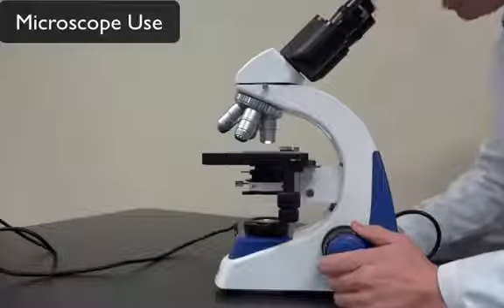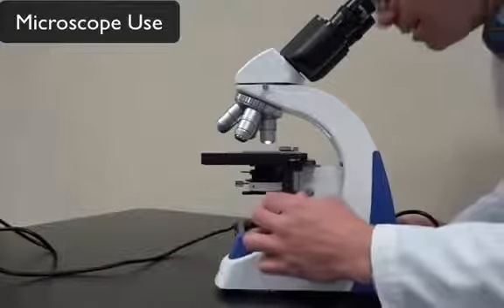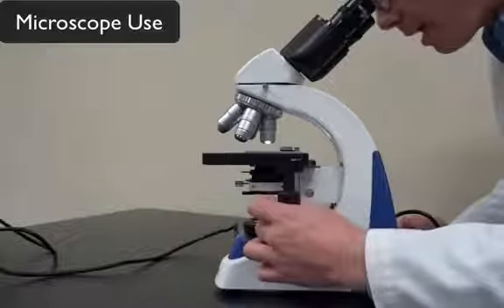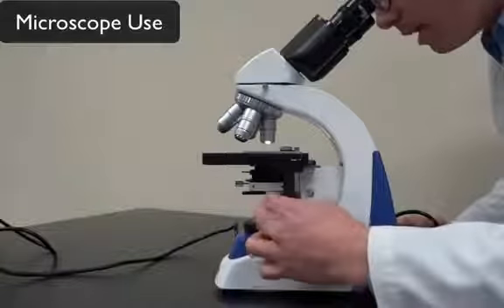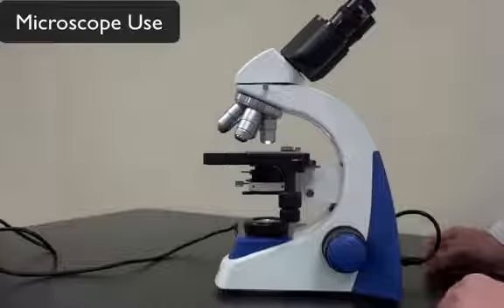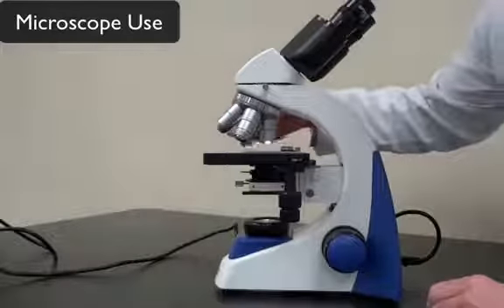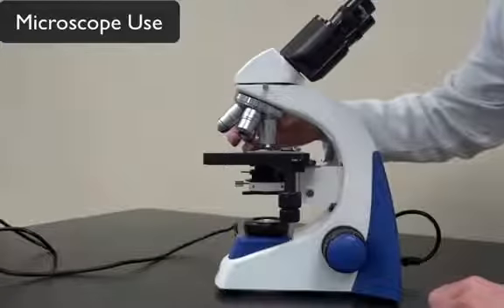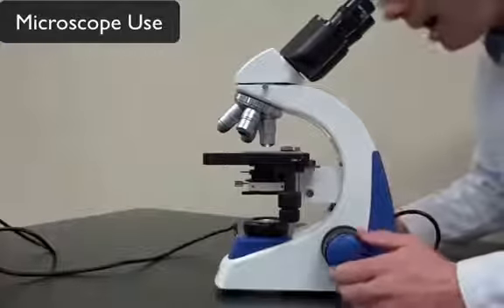Once it's in focus, what you want to do is then scan around looking for a particular area that you want to enhance in magnification. Okay, so let's say right there is a spot on the slide that I want to view in more detail. So I'm going to carefully go to the next power, the low power, and I'm going to take a peek in here.